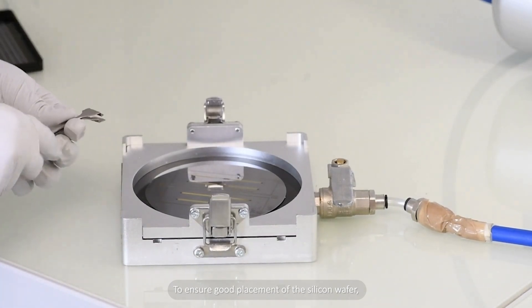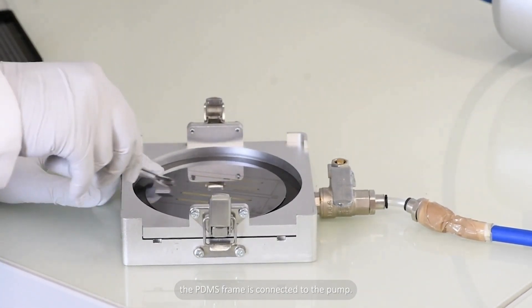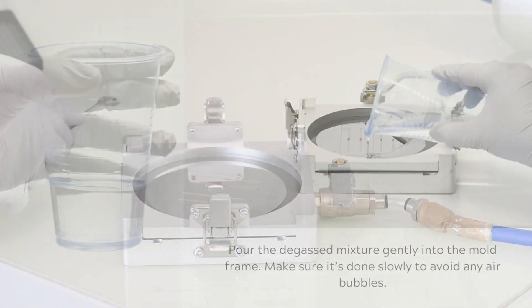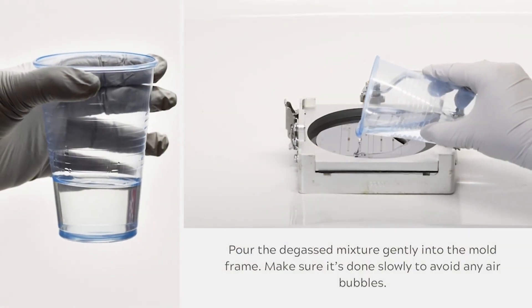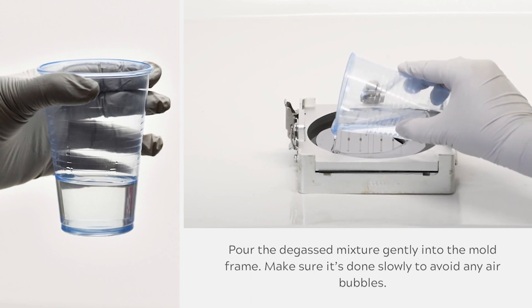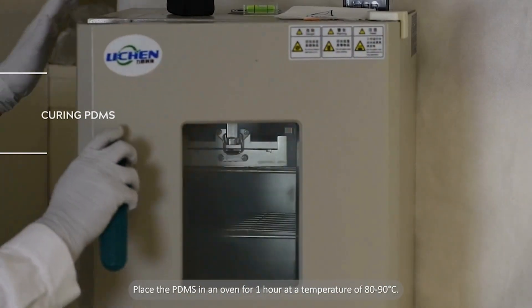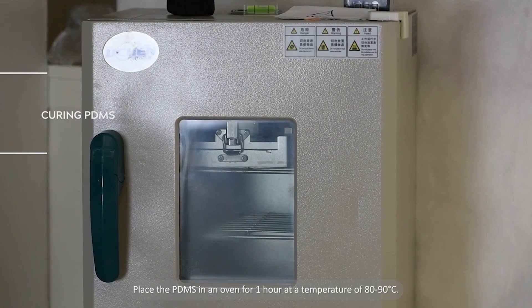To ensure good placement of the silicon wafer, the PDMS frame is connected to the pump. Pour the degassed PDMS gently into the mold. Make sure it's done slowly to avoid air bubbles. Place the PDMS in an oven for one hour at a temperature of 80 to 90 degrees Celsius.